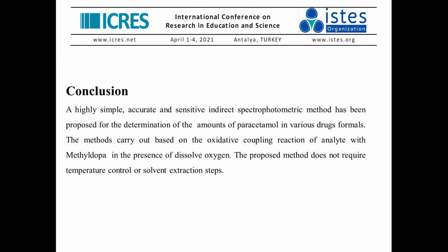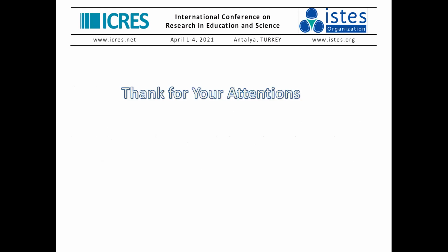Also in our experiment, we don't need to control the temperature or use a solvent extraction step. Therefore, we developed a very simple, accurate spectrophotometric method for determining a very common drug, which is paracetamol. Thank you for your attention.